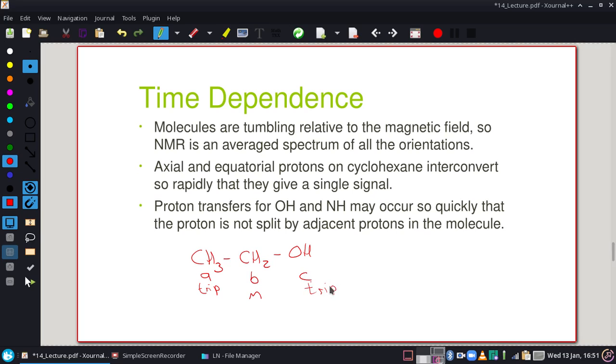All right, that is expected, but we see something weird happen on this last position and even this one right here. Hydrogen bonds are quite strong. So in a sample of pure ethanol, we would expect a nearby alcohol molecule to make a very strong hydrogen bond with it. It's actually strong enough that in certain situations this hydrogen acts like it's attached to this one at the same time, giving us yet another thing that would split the peak. So we were at a triplet, now we're at a quartet, and the same thing happens here. It might actually split this one.